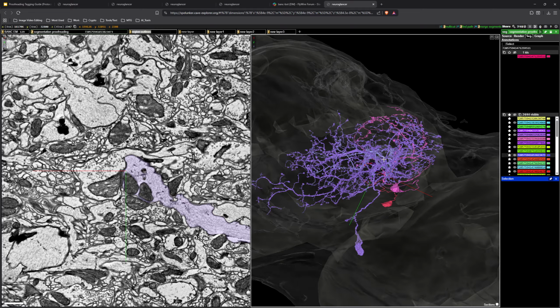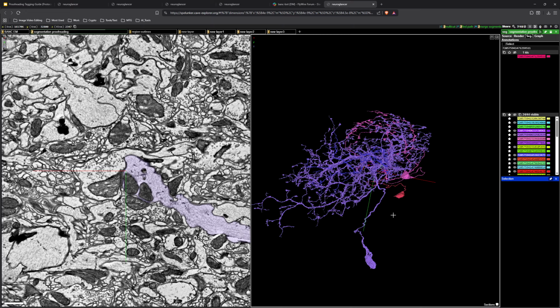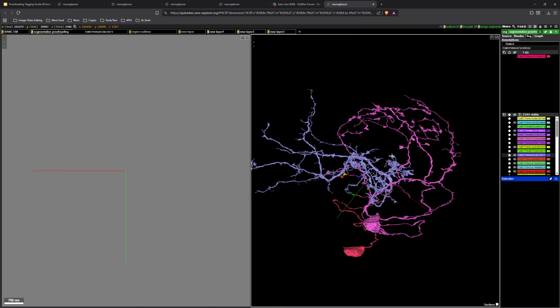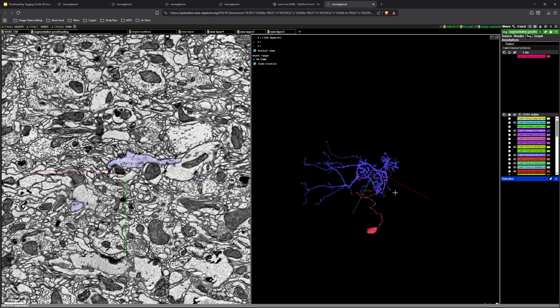I know there's lots of sub neuropils within this, but what we're looking at here is that most of this one's a little bit too big, but this pink one, I mean, it does look different, but if you grabbed this pink one and squished it in your hand, it might look something like this. So most of this is probably done. And instead of can't fix, this could be a can't trace to Soma.